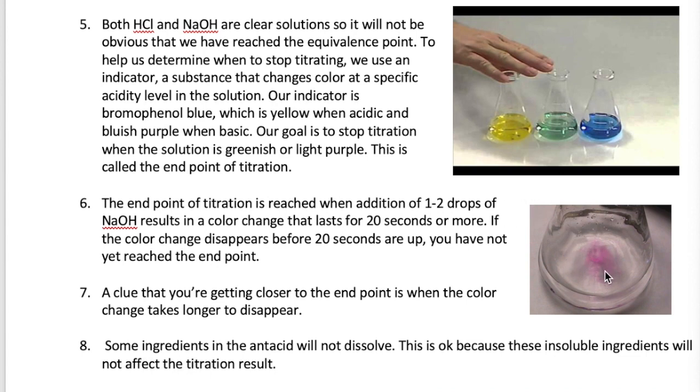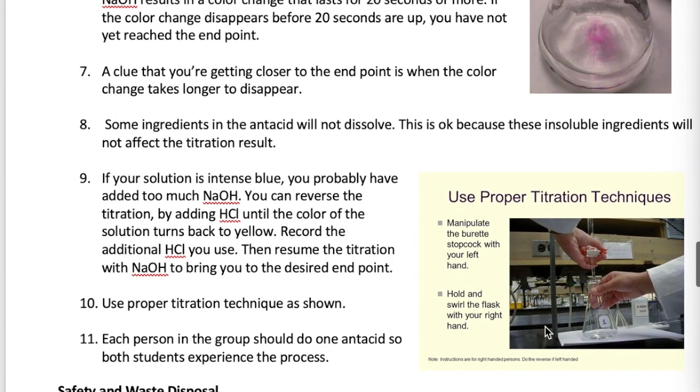As you're adding more NaOH, you will find that the blue color will take longer to disappear after mixing. This is a sign that the endpoint is near. At this point, you want to start adding your NaOH drop by drop. When the green or blue color appears after addition of one to two drops of NaOH and stays for 20 seconds or more, then you know that you have reached the endpoint. The picture here shows the correct way to carry out a titration. One hand should be used to control the buret stopcock and the other hand should be used to swirl the Erlenmeyer flask as the NaOH is being added.